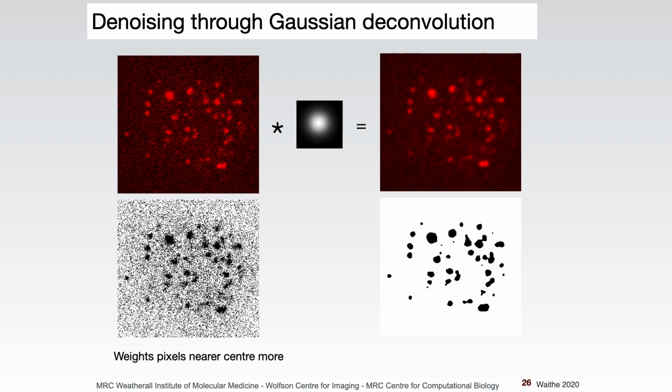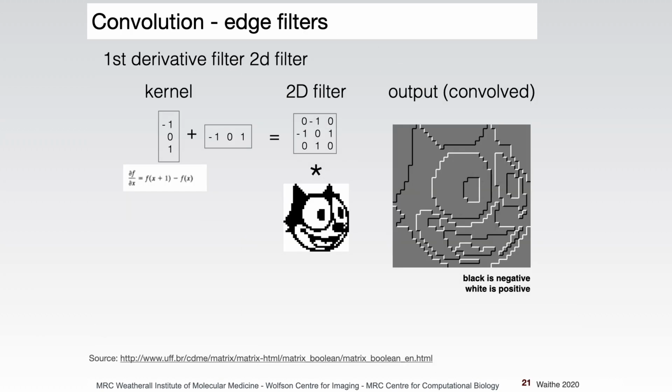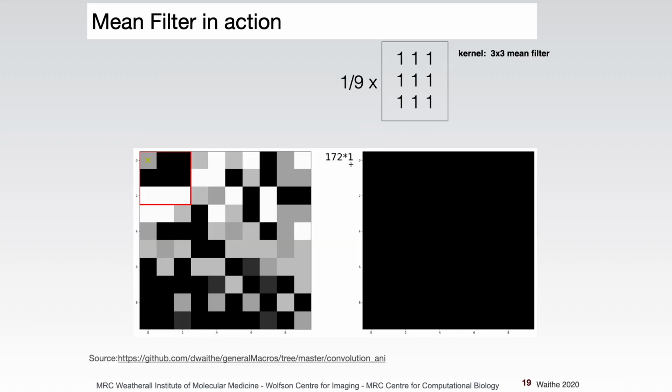So convolution just means using a filter? Yeah. So what we say is this process, this is the convolution. Here we've got the equations for doing convolution. But convolution and filtering are the same. Okay. And actually convolution and linear filtering is the same.